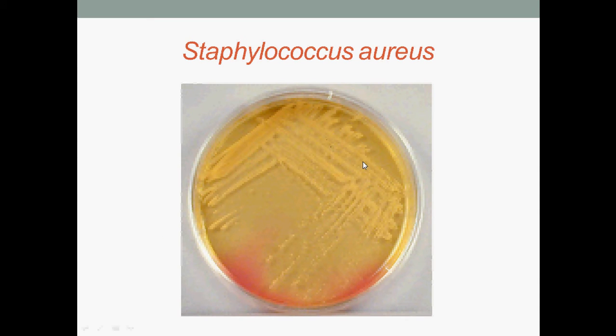Here we have Staphylococcus aureus growing on mannitol salt agar. You can see that the area around the colonies is rather yellow. Mannitol salt agar contains mannitol and uses phenol red as a pH indicator in the medium. At pH levels below 6.9, the media is yellow in colour. At neutral pH, the colour is red. While above pH 8.4, the colour of phenol red is pink. When mannitol is fermented by a bacteria, an acid is produced, resulting in the formation of a yellow area that surrounds the isolated colony.